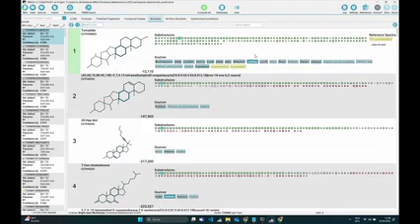And if you just have some small squares, these are predictors which are not too trustworthy, which don't have a high quality. So if you have some small red squares, it doesn't matter too much. What you can also do to get a quick overview is you can right-click on a structure, and then the first option will be highlight matching substructures, and it will just give you an overview on everything that matches.